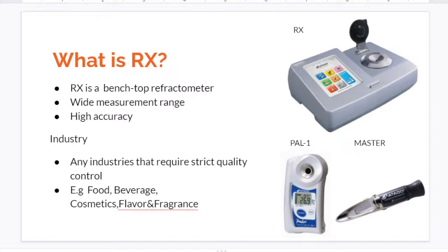Rx can be used in any industries, from food and beverage industry to cosmetics and flavor and fragrance industries.